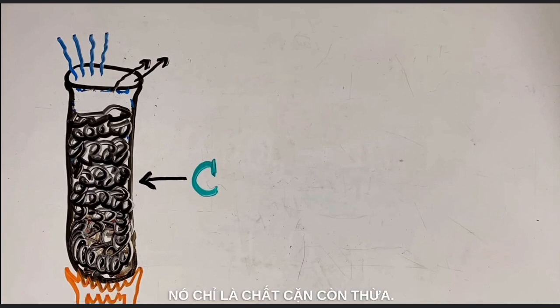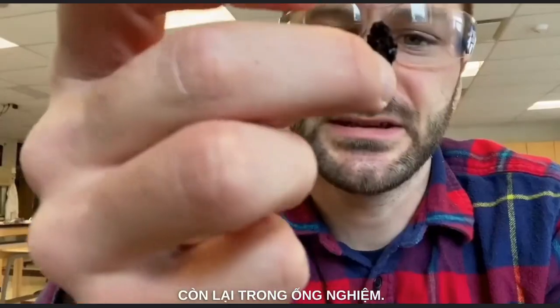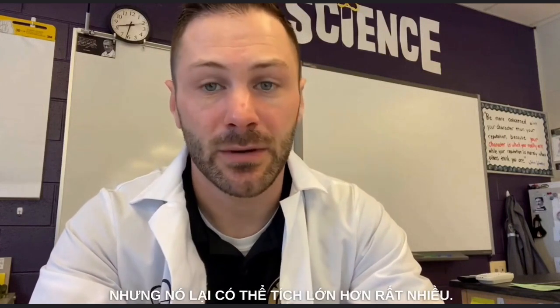It leaves behind waste. That waste in this case is carbon, the black, chunky, flaky, bitter-tasting stuff that's left over in the test tube. When we break it open, we see that there's a lot left over. It's expanded, but it's very porous, which makes it lighter than the sugar originally was in weight, but it took up a lot more space in terms of volume. It occupied almost the whole test tube.